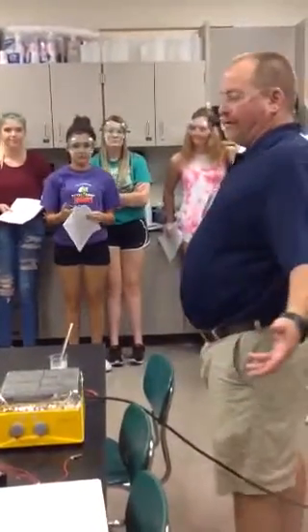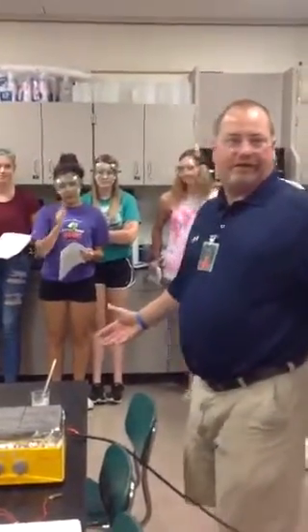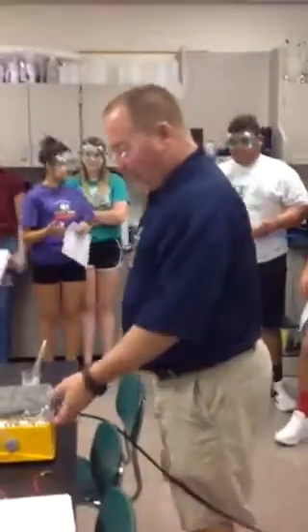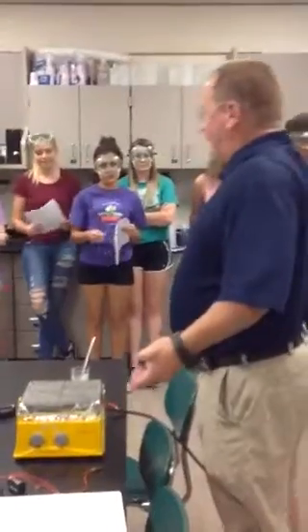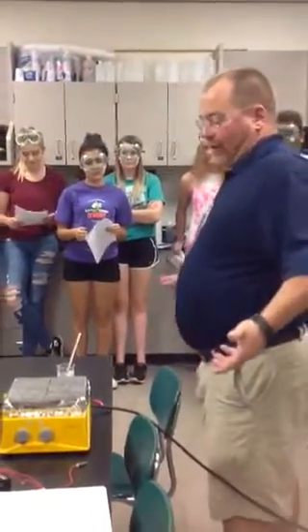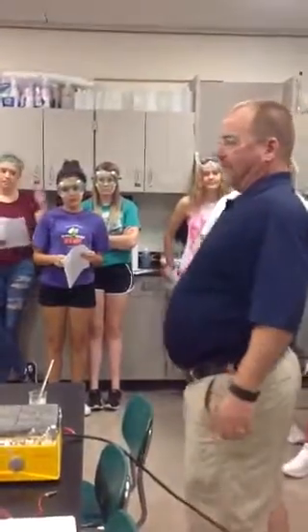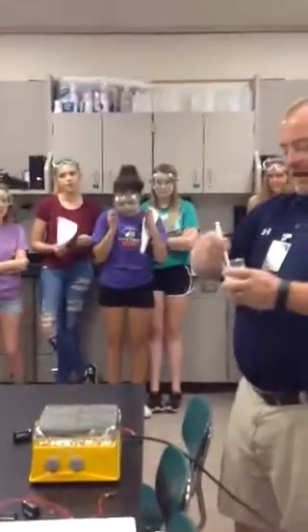Now, is aluminum a good conductor of heat and electricity? Yes. So the only purpose the aluminum serves is that I don't have all these things possibly melting on my hot plate, because that is not what I want. So what I'm going to do is, I'm just going to read my label.